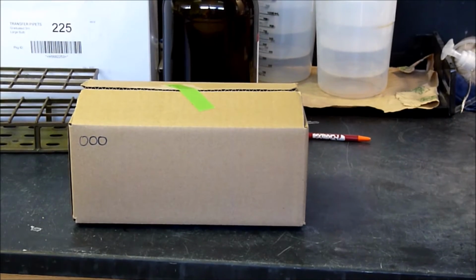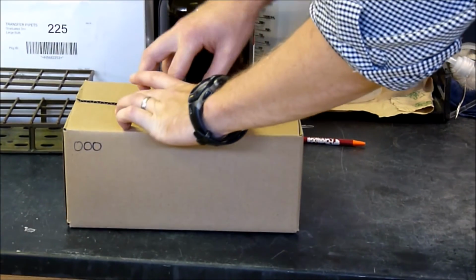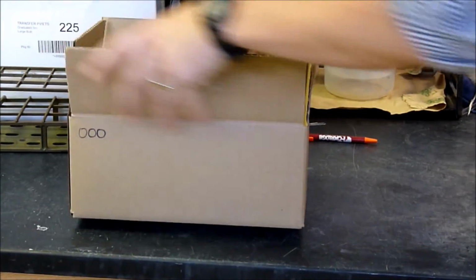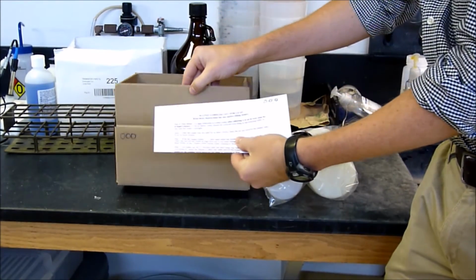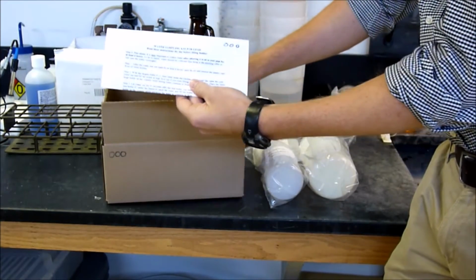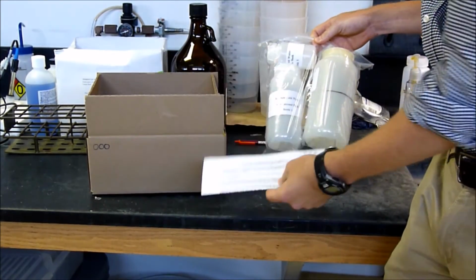The first thing that you need to do is to unpack the lead sampling kit by just opening up the box and removing the contents. You'll have 3 sampling bottles and an instruction sheet. Everything in the box is labeled with the same number, as you can see on the exterior of the box, on the instruction kit, and each bottle individually.